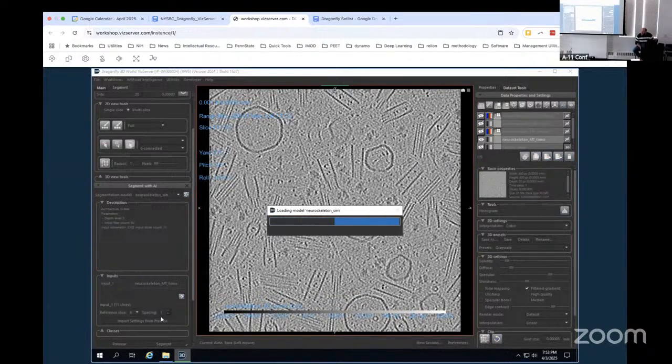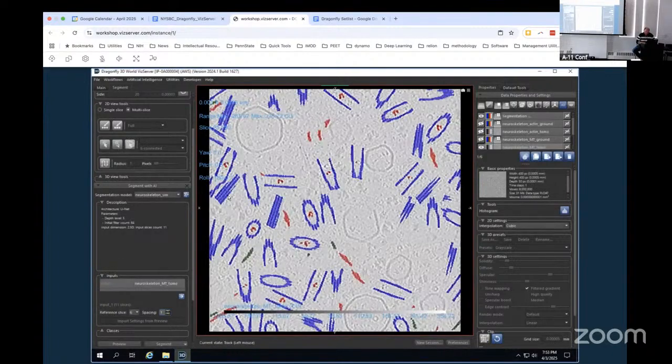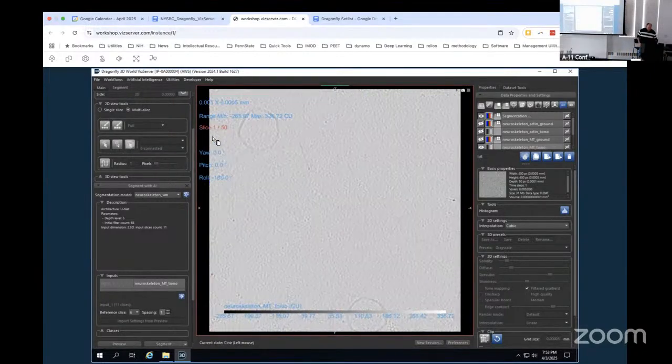It's a good idea to look at your training data and just make sure that it actually functions on the data that it knows. But you'll see, it actually learned to find that central bit. But it doesn't do it in real data. It specifically knows how to find this one. So it's pretty good.